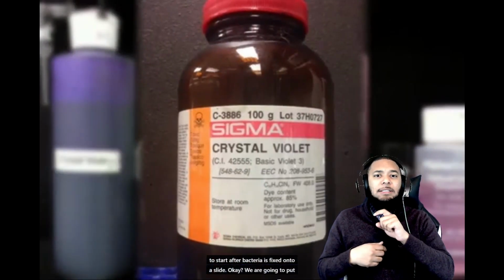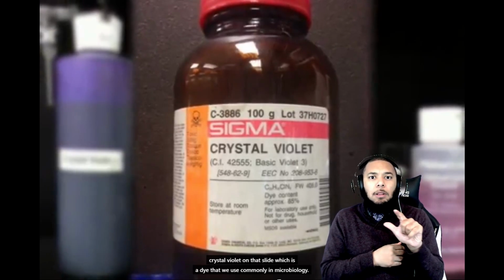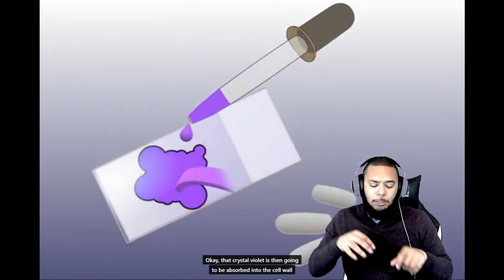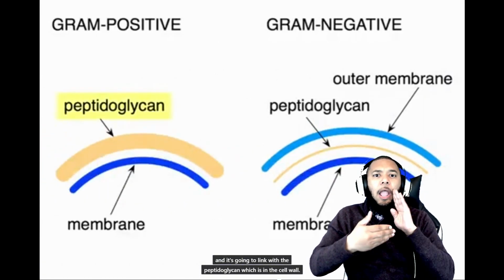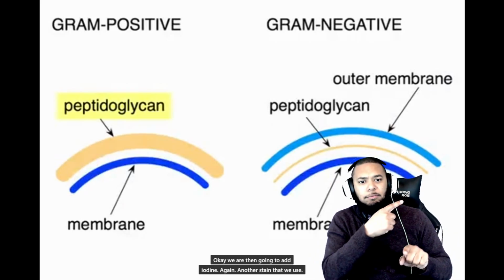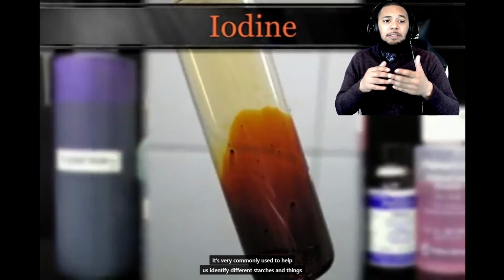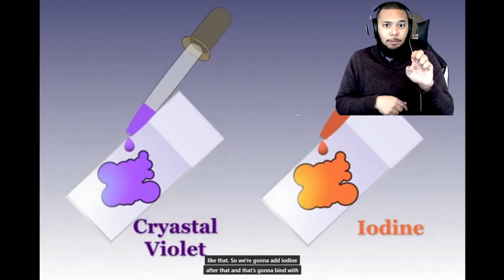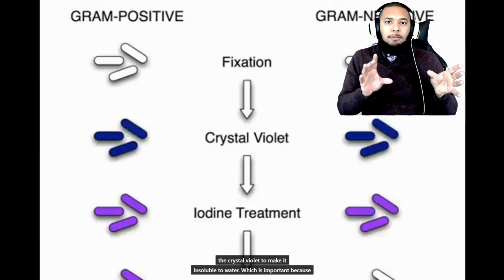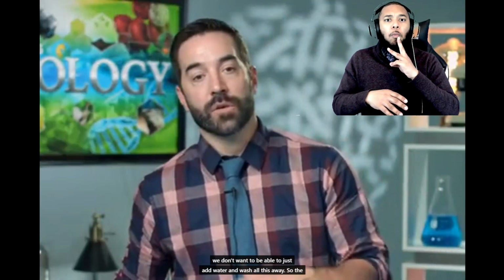So what we're going to do, to start, after a bacterium is fixed onto a slide, is put crystal violet on that slide, which is a dye that we commonly use in microbiology. That crystal violet is then going to be absorbed into the cell wall, and it's going to link with the peptidoglycan, which is in the cell wall. We are then going to add iodine, another stain that we use. It's very commonly used to help us identify different starches and things like that. The iodine is going to bind with the crystal violet to make it insoluble to water, which is important because we don't want to just add water and wash all this away.